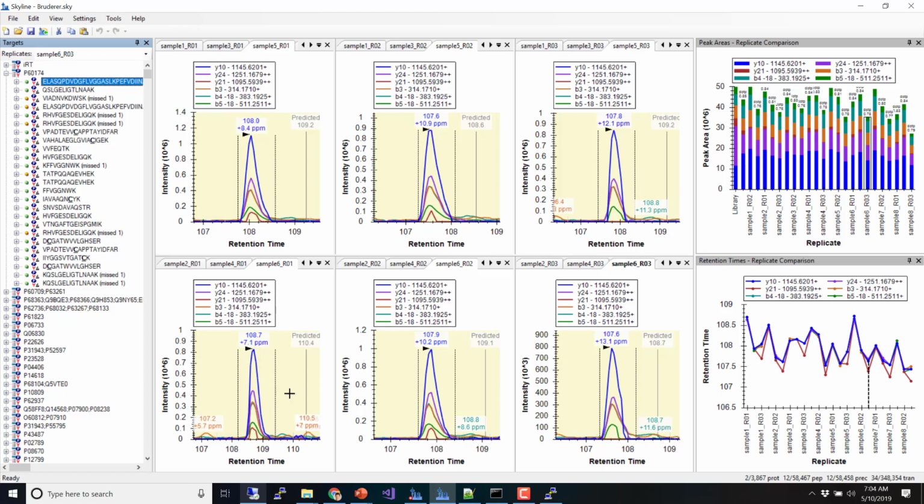That looks pretty nice, although, oh, that's retention time. It's not super stable in retention time, and there's some jitter over the, so which order am I in right now? Anybody know?